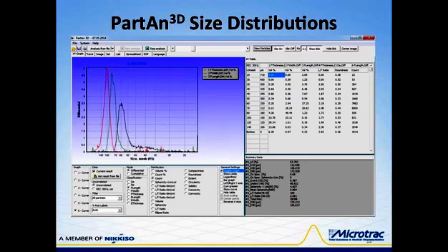And they are in the size order that would be expected. Length, the black curve, is largest, width in green is second largest, and thickness in red is of course the smallest of the three major axis dimensions. The window in the lower left allows the user to select different parameters to report, and user selectable summary data are displayed in the lower right window.